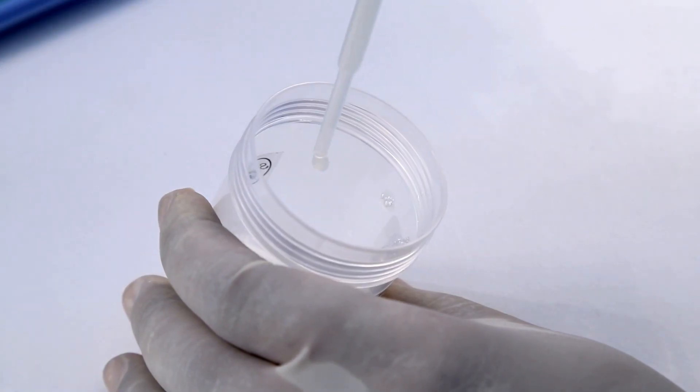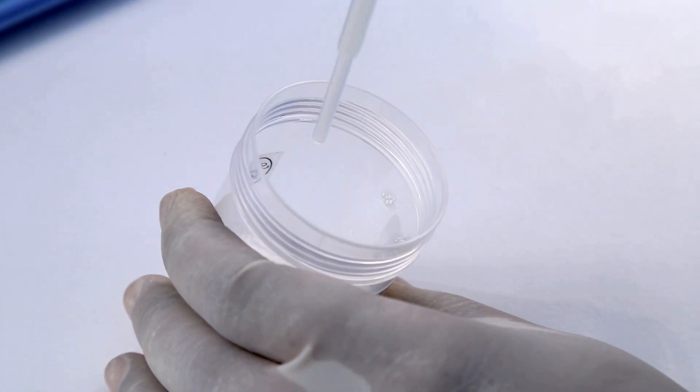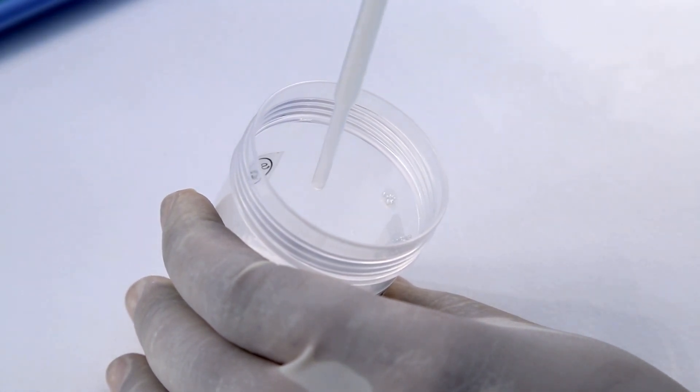Perform the string test. Measure the length of the string in millimetres. Note the results.